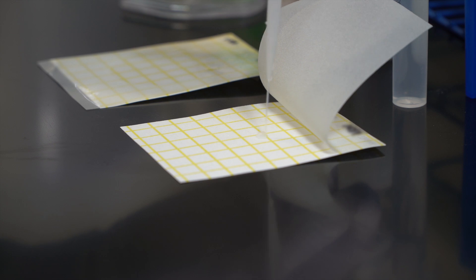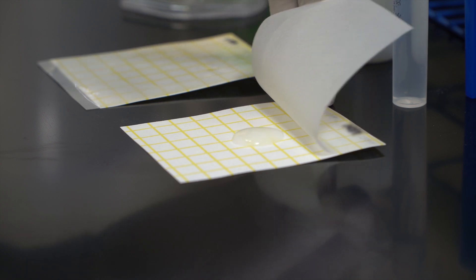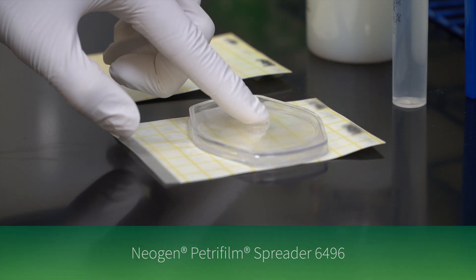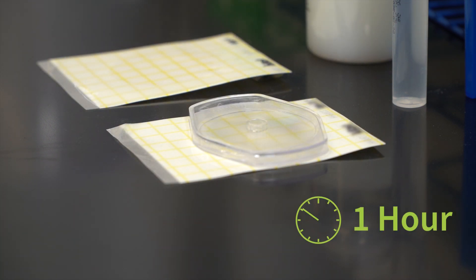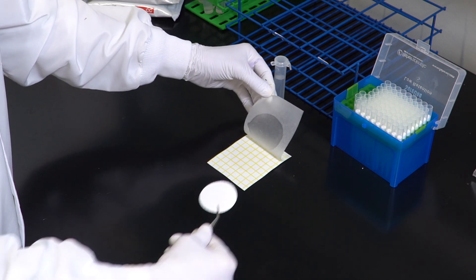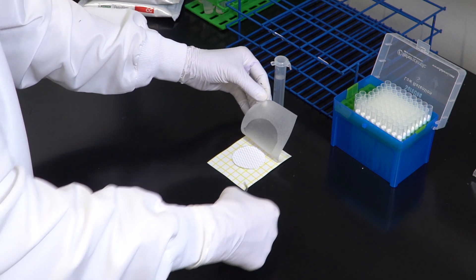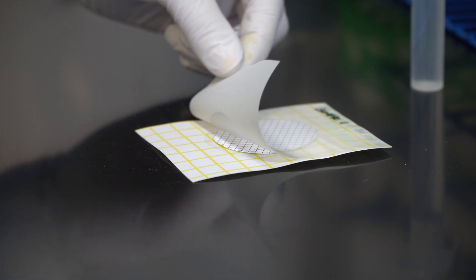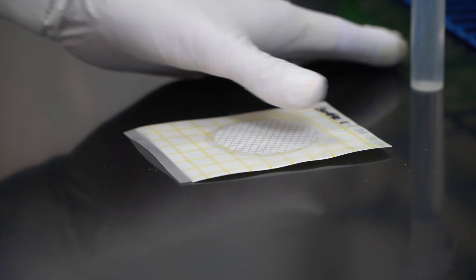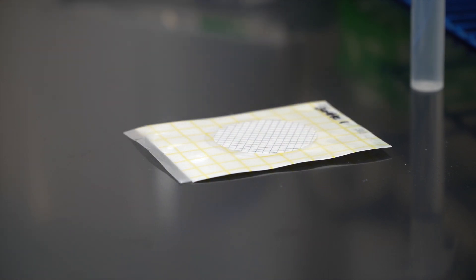For filtered water samples, hydrate the Petri Foam plate with one milliliter of appropriate sterile hydration diluent, as seen with direct plating. After a minimum of one hour, carefully lift the top film of the plate, place the filter on the center of the hydrated area, slowly replace the top film onto the filter, and lightly apply pressure to ensure contact of the filter with the gel.